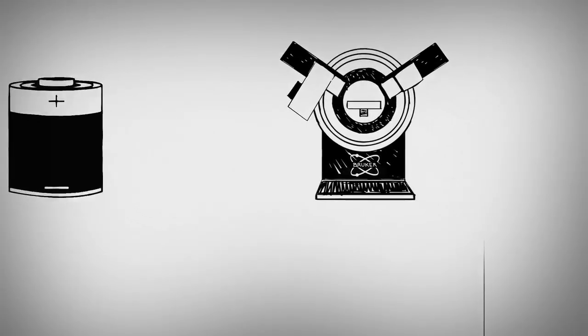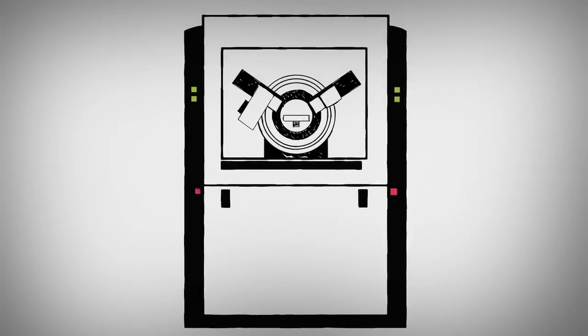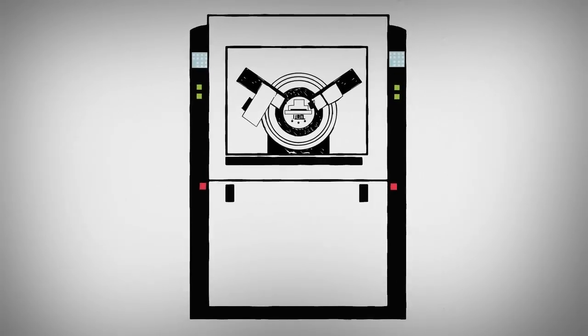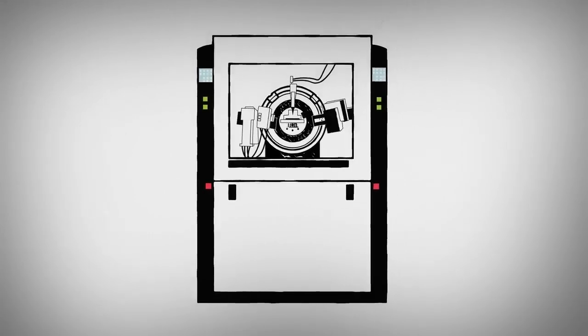As scientists push their ability to engineer materials on the atomic level, X-ray diffraction becomes an increasingly important tool in their toolbox. Advances in equipment design have made X-ray diffraction easier to use and more powerful than ever.